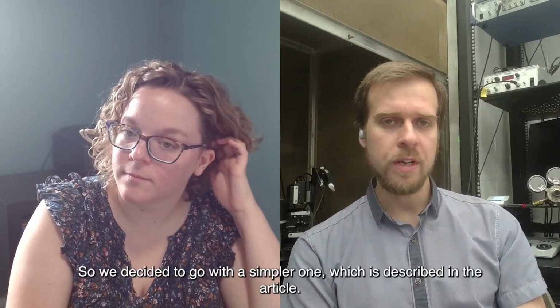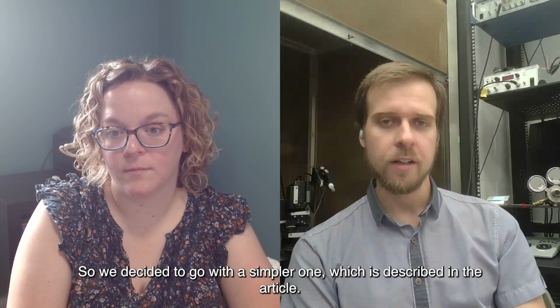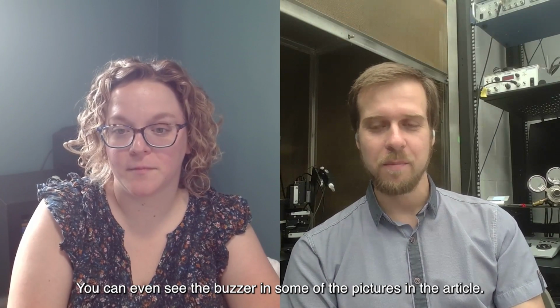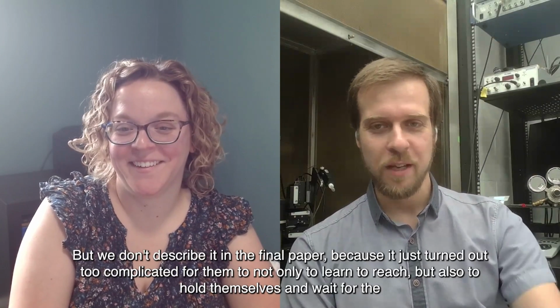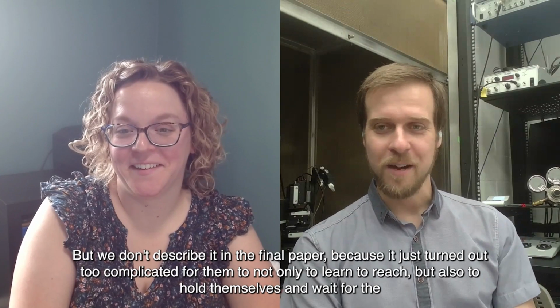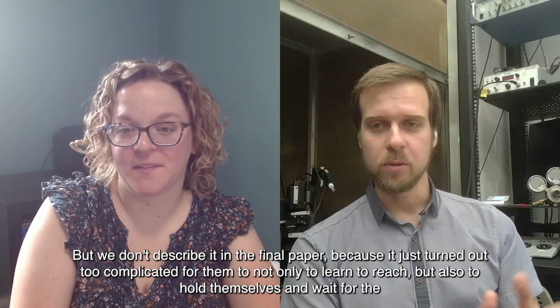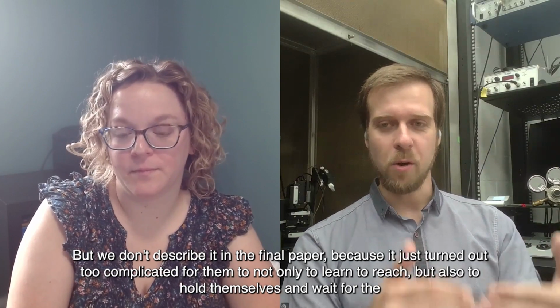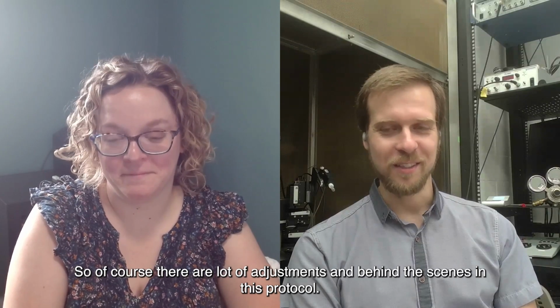So we decided to go with a simpler one, which is described in the article, but it's even reflected in the design of the box itself. You can even see the buzzer in some of the pictures in the article, but we don't describe it in the final paper because it just turned out too complicated for them, not only to learn to reach, but also to hold themselves and wait for the buzzer. So of course there are a lot of adjustments behind the scenes in this protocol.